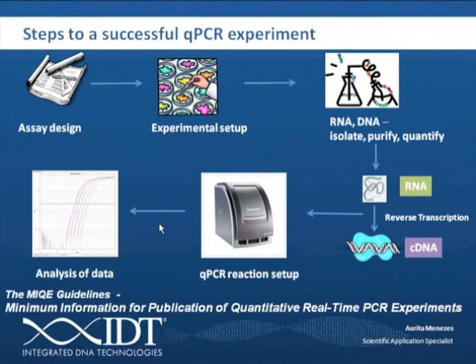Also keep in mind that much of what I discuss today is based on the MIQE guidelines. MIQE basically stands for the minimum information for publication of quantitative real-time PCR experiments. These are a group of guidelines that were put together by leading scientists in the research field.